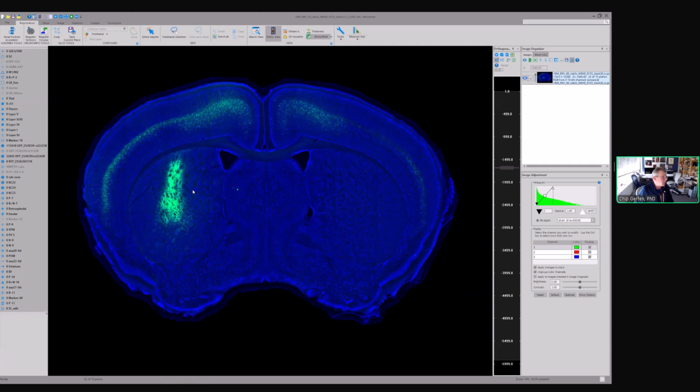This is ideal because the expression of that bird receptor can be controlled and only expressed by neurons that express something like Cre recombinase. So viral vectors are made so that the bird virus receptor is only expressed on neurons that express Cre recombinase. In this study, and in other studies, we use brains in which Cre recombinase is expressed, in this case, in D1 receptor neurons in the striatum. Then the bird virus receptor is only expressed by D1 neurons, and rabies, when it's injected, will only infect those neurons that have the bird virus receptor. And then it's transsynaptically transported from the neurons that are innervated in the striatum back to the neurons in the cortex that provide the projections to those.